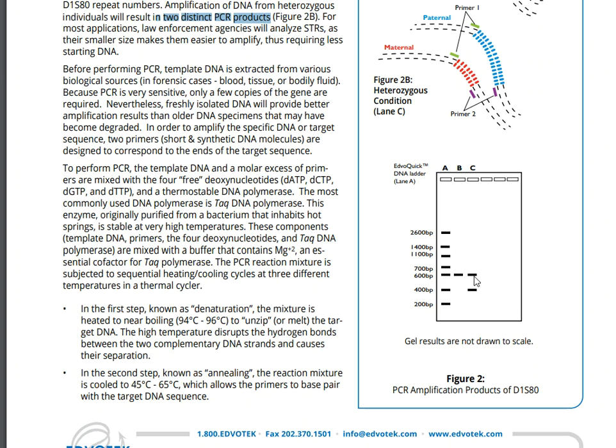So you'll see two bands form, because one's coming from the mother and one's coming from the father. They're not the same length, they're not the same base pair number, which means they have different molecular weights and they travel through the gel electrophoresis in a different way. But these are polymorphisms that we are seeing in our actual DNA electrophoresis. Okay?